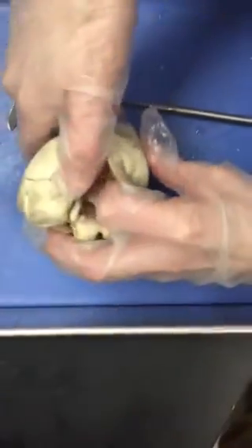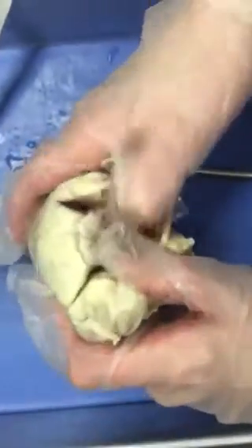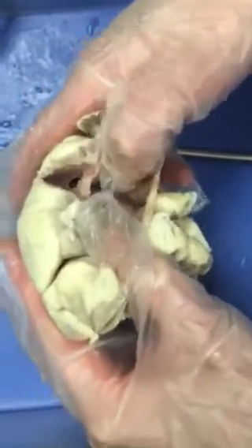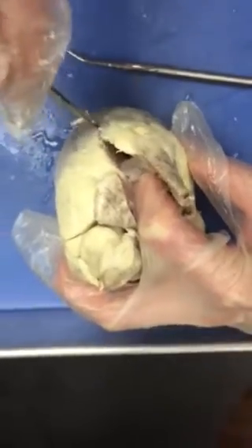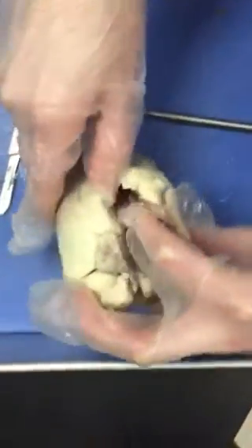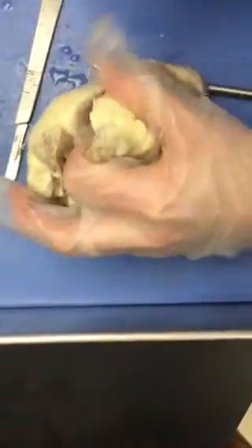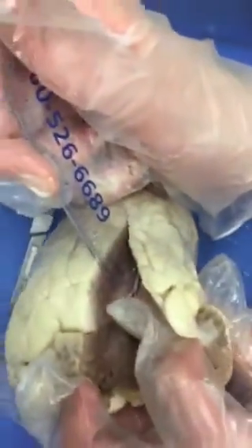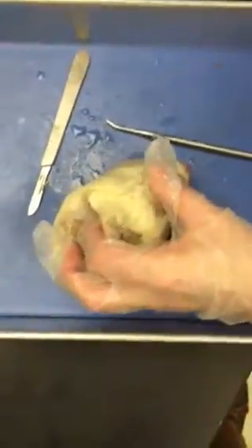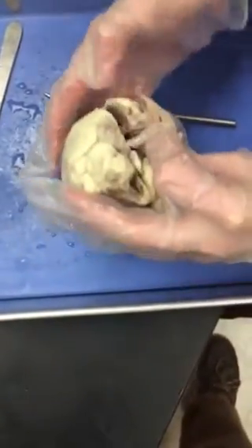27. Gently pull back the tissue, exposing the inside of the cavity. Observe the tissue in the wall and the inside of the cavity. 29. Use your metric ruler to measure the thickness in millimeters of the atrium wall and record your measurement. 1 centimeter.